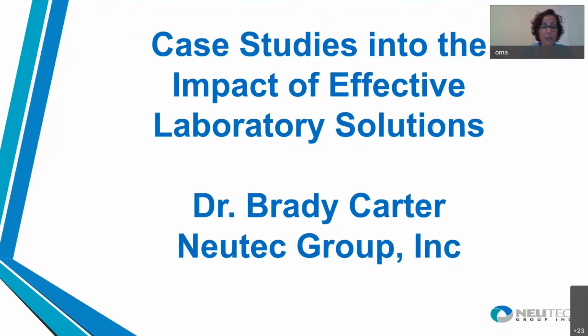Other solutions can be used for analysis of water activity, color, shape, and size. Effective laboratory solutions are critical to building a quality program that ensures both product safety and quality. In today's webinar, specific practical applications where lab solutions and automation played a critical role in overcoming failures and making Six Sigma improvements will be discussed.